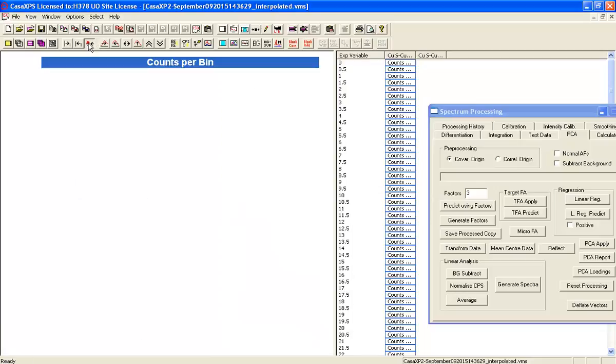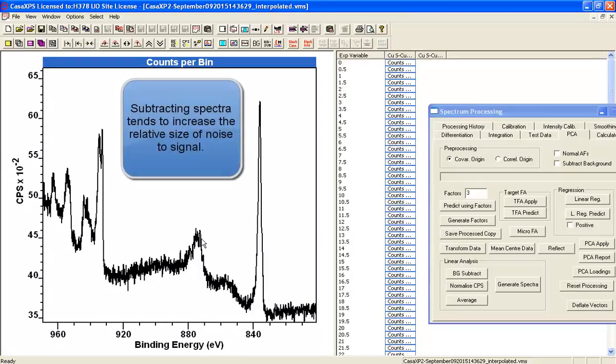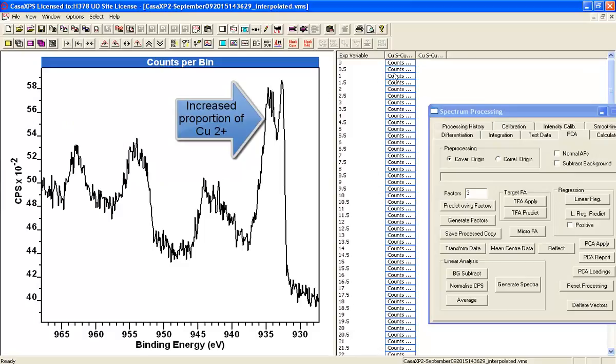And let's again look at the Auger peaks, and yes, there's some, although noisier now, we seem to have something that gives us a reasonable approximation to a set of copper Auger, and we've manufactured from the two initial states. Let's demonstrate this.